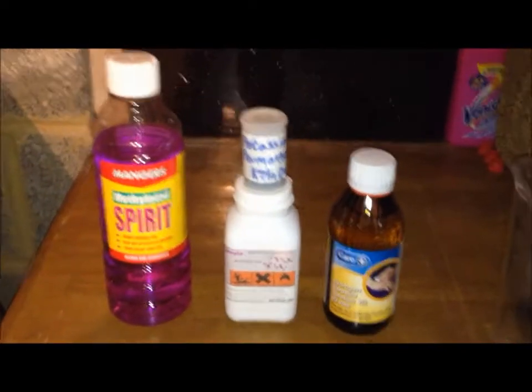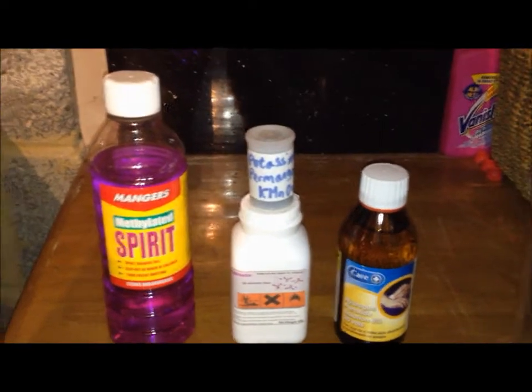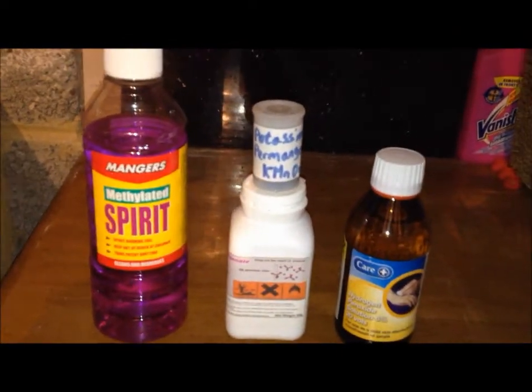Moving on to spirits and oxidizers. Methylated spirits is the only spirit I use and need — to use for my meth burner. It burns really well and it's a good, safe sort of flame.